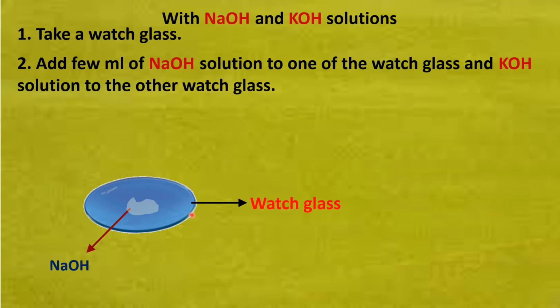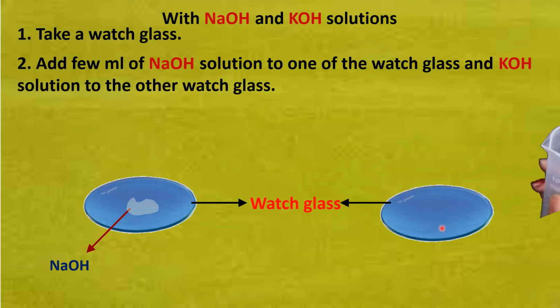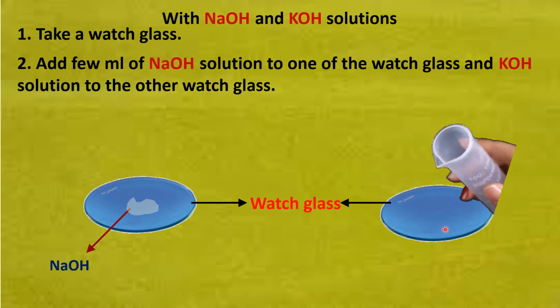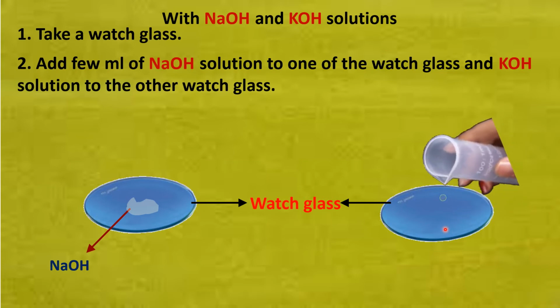Now we'll take another watch glass. What we have to add here? We have to add potassium hydroxide solution to this.